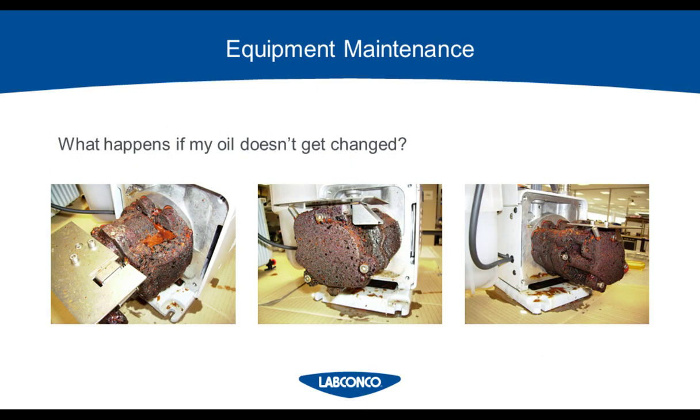If you don't do oil changes, this could be the outcome of your pump. And at this point, unfortunately, the pump cannot be repaired because it is beyond that point.